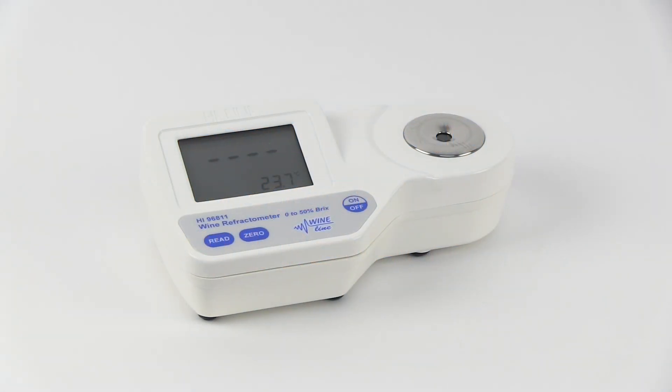The HI-96811 is a portable refractometer. If you are unfamiliar with the HI-96811, please watch our in-depth product demonstration here.